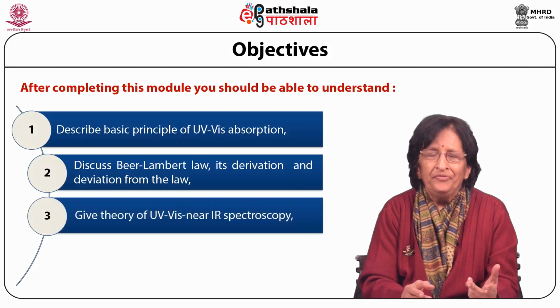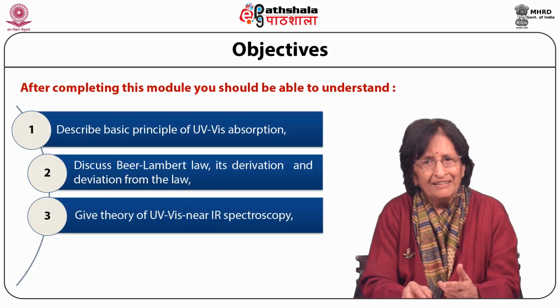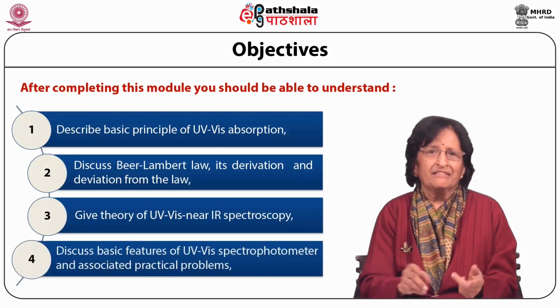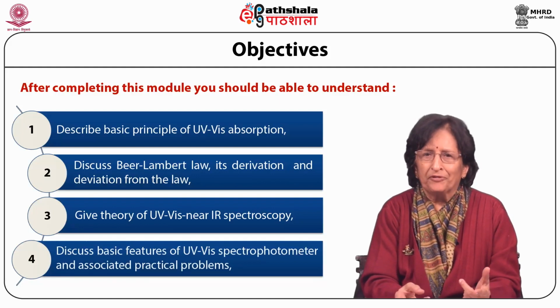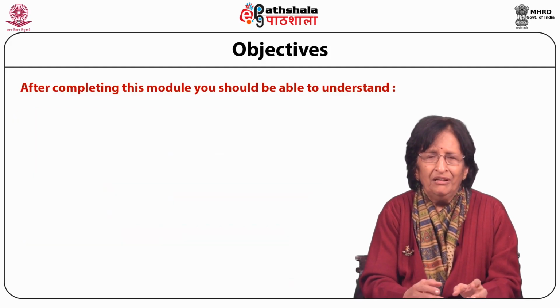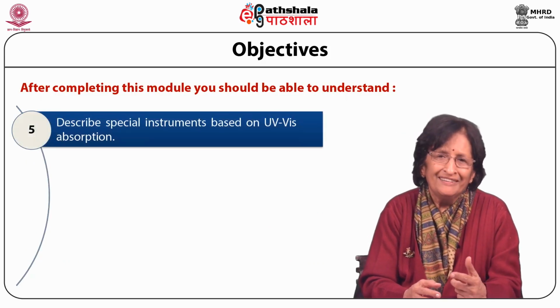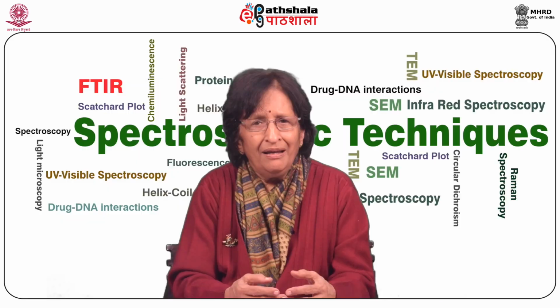We'll give you some theory behind UV-Vis and near IR spectroscopy, discuss some basic features of UV-Vis spectrophotometer and associated practical problems. We'd like to describe some special instruments which are also based on UV-Vis absorption.